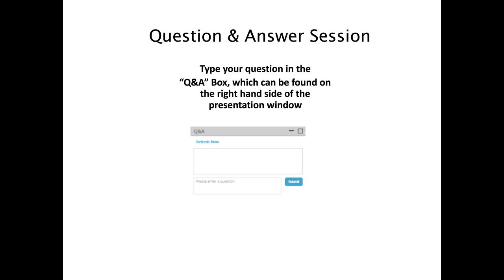Do you have any recommended method transfer tools? Yes, there are several sources of free method transfer tools, and I could send you the information if you provide your contact information. Excellent. How do I estimate the pressure I'll get? So, like I said before, if you know the flow rate, column porosity, temperature, mobile phase viscosity, and the column permeability, you can estimate that pressure by calculation.